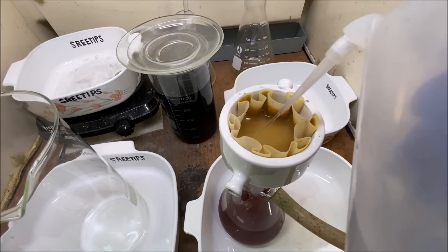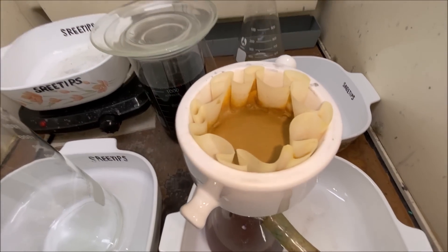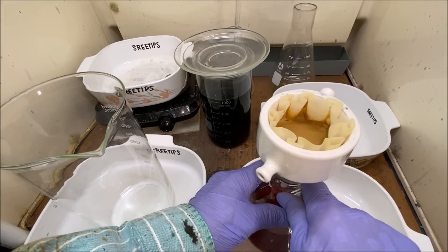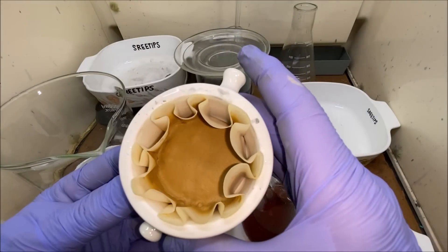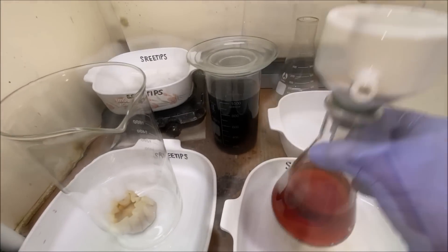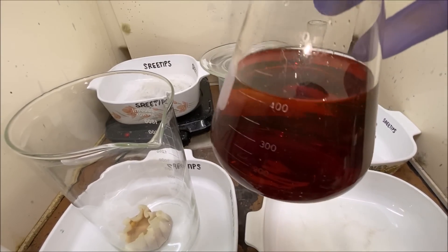We're taking some distilled water and rinsing the solids off. You can see the filtrate is running clear out of the bottom of that funnel. Now we'll transfer the solids — which should have precious metals in them — into a clean beaker. This solution should have a little bit of silver and a little bit of palladium in it, so we'll set this back out of the way.